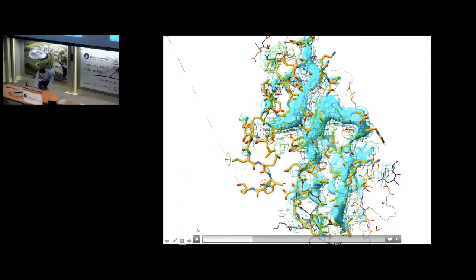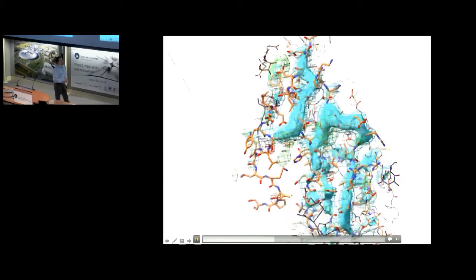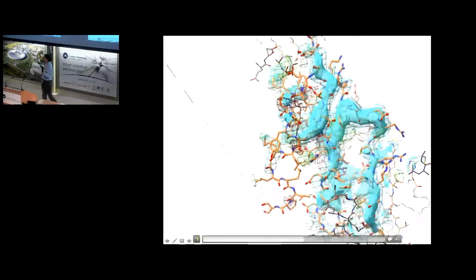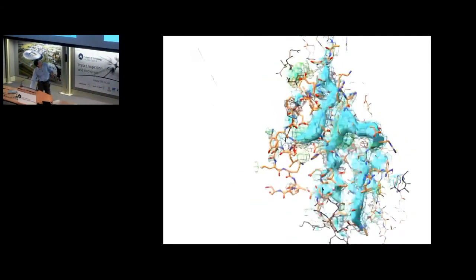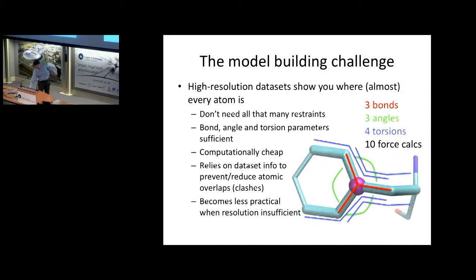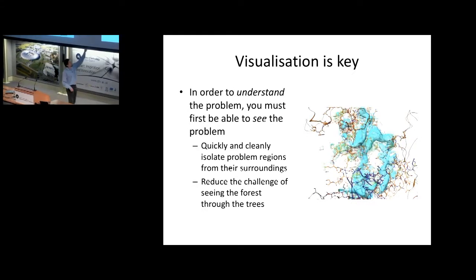And so, via any traditional technique, what you would most likely be doing in this situation is tearing that whole section down and rebuilding from scratch. That's not what I want to do, though. I'll just let that finish.